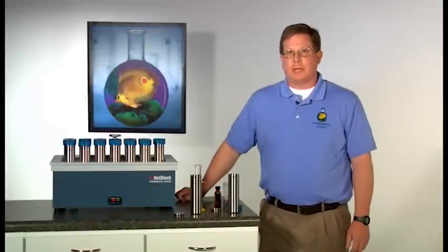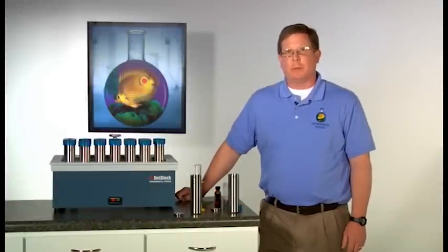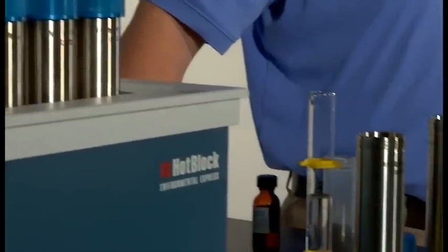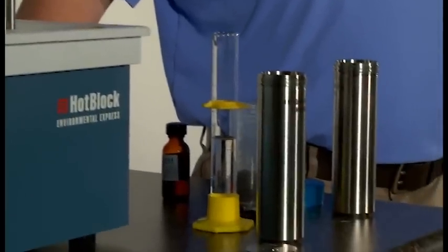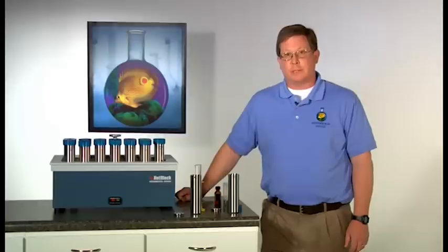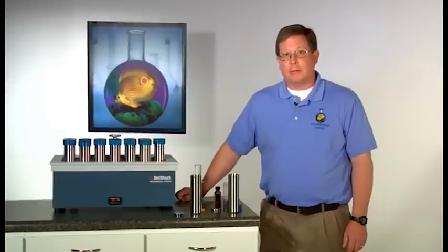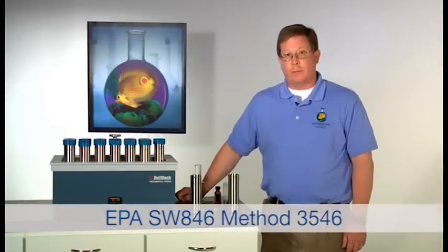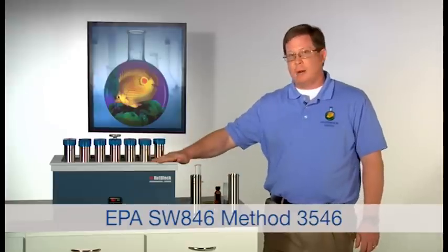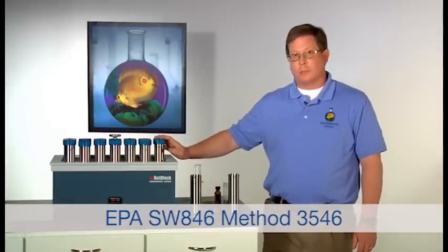Hello and welcome to Environmental Express Tech Tips. My name is Joe and today we'll be reviewing the soil cell system for the extraction of semi-volatile compounds in soils and other solid matrices. This extraction technique follows EPA SW846 method 3546 and utilizes the 100 mil hot blocks and the stainless steel soil extraction cells.